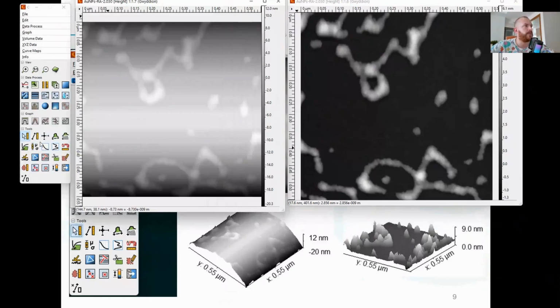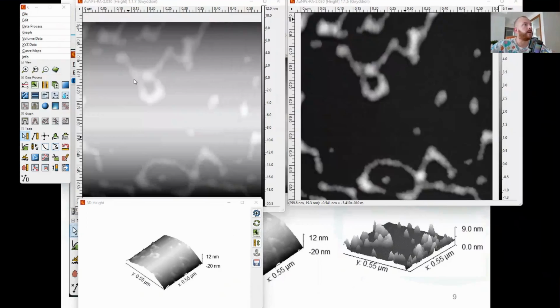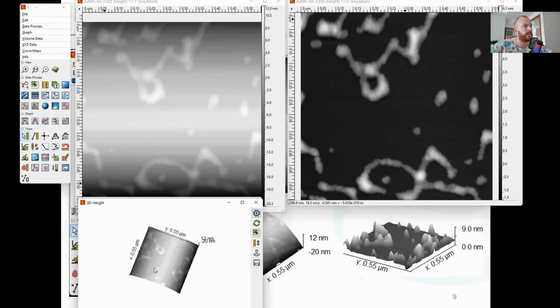There is a button for 3D. Yeah, like this, I think. Yeah, so we press this button, we have the image, and we do see that it's bent. So this is exactly what happens when you have raw data. What I said, it's not exactly like this, it's like this. So it's a parabola or semicircle.